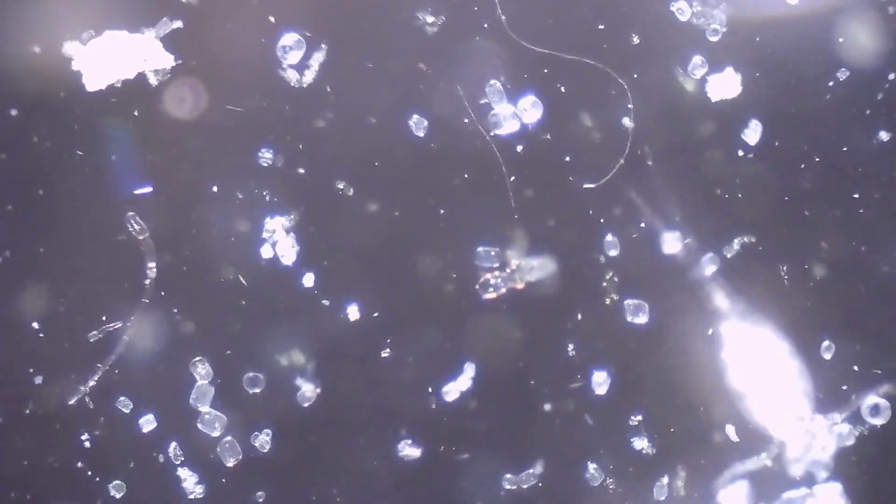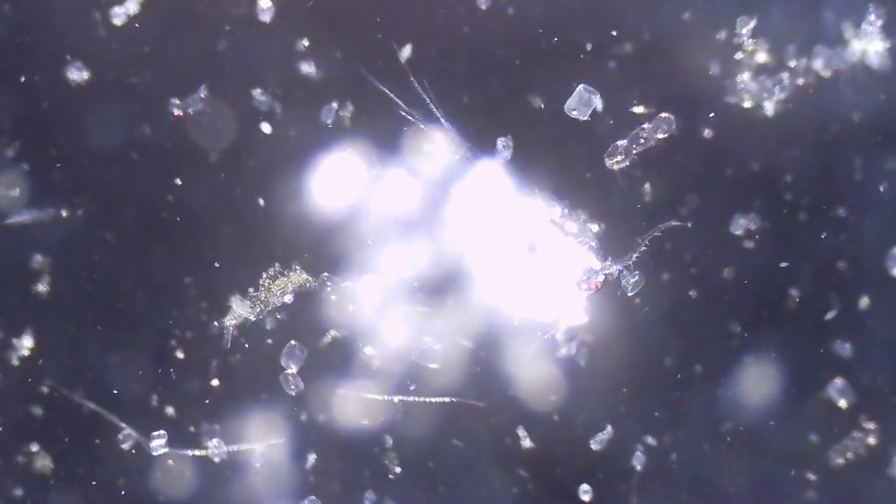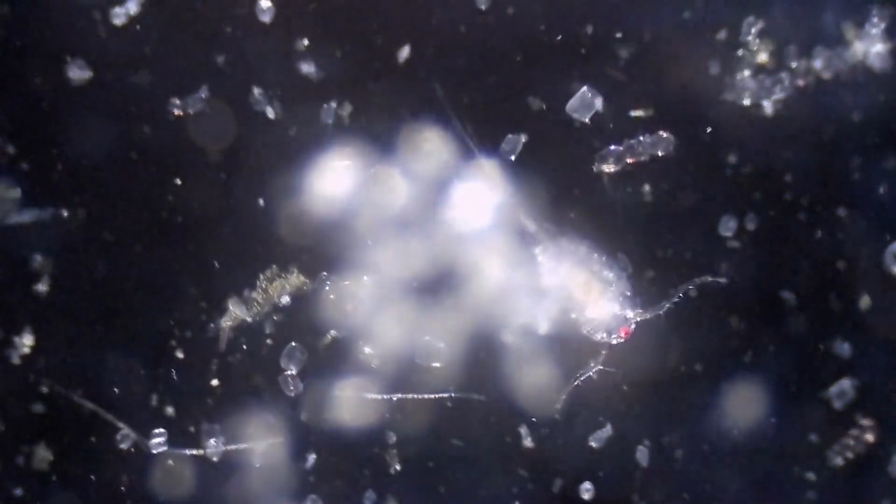Now, instead of having the light on the bottom, I'm having the light on top now, so we can look at what this thing looks like instead of looking through it. Now, this is one of the copepods. I'm turning the brightness down. His eyes are red. I think those are his eyes. You see how that reddish color at the front? I'm pretty sure that's his eyes. This thing looks like a copepod, looks like a water flea. I'm not 100% certain what it is, but I know they're fairly common in the aquarium here.